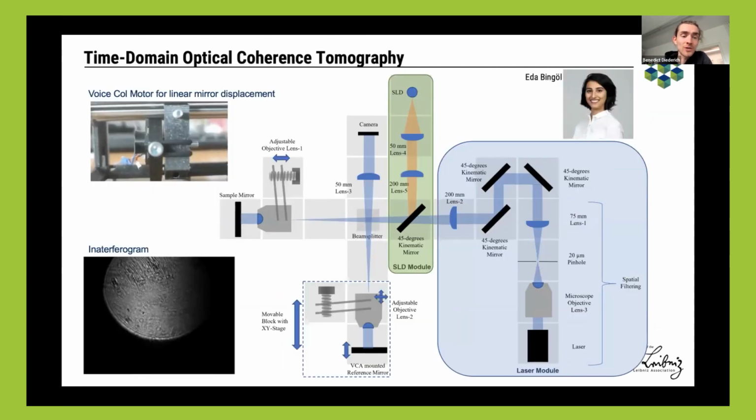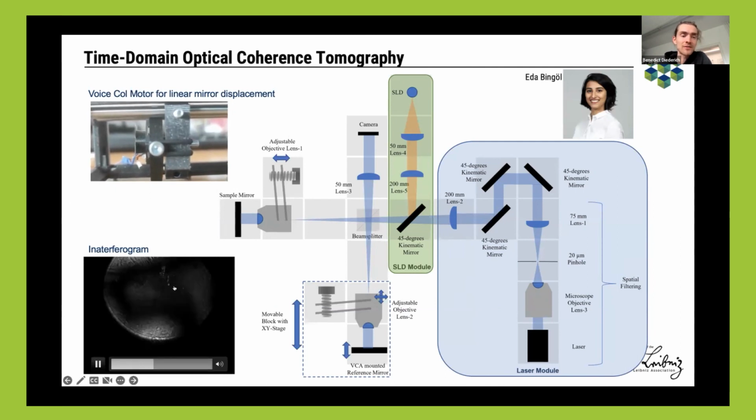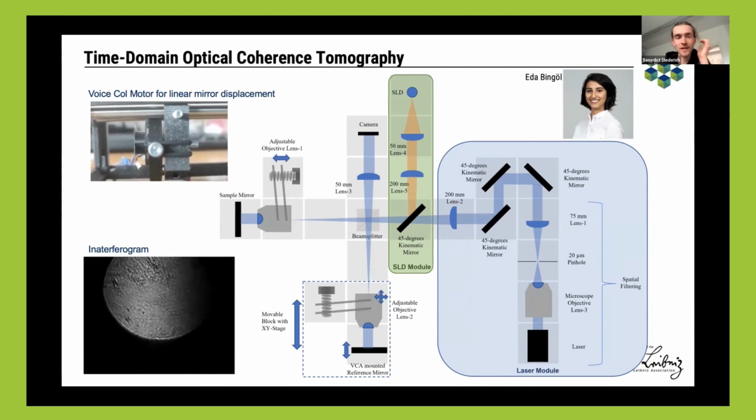You can also do OCT. Many people always ask, plastic is not really stable. We tried to disprove that by showing you can create a stable interference signal to eventually also recover 3D information. So this is very, very new. So we don't have reconstructed data yet.